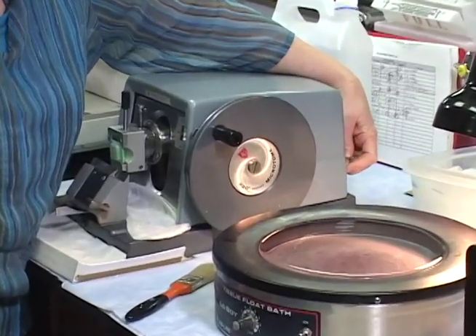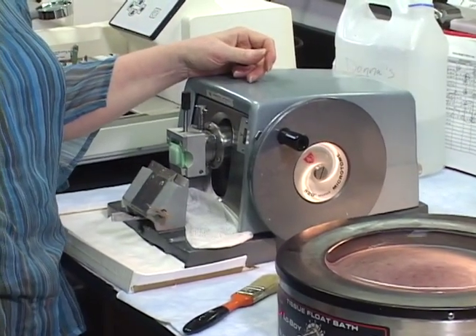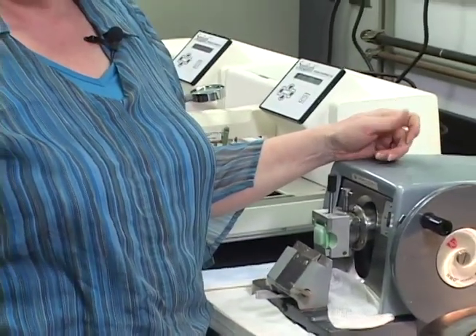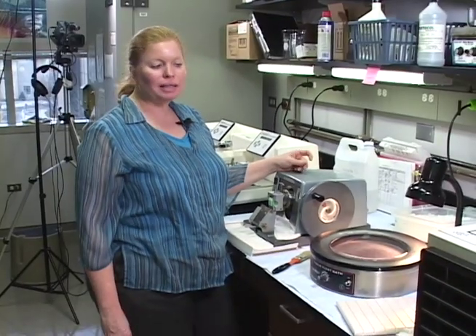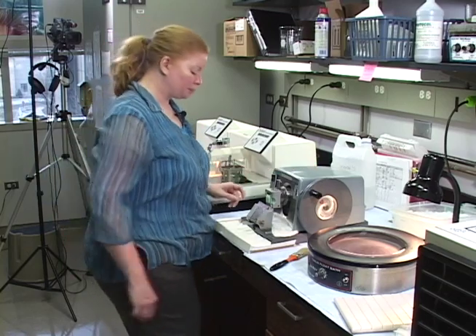Anyway, so we have ours set at 5 for those epidermal equivalents. Other tissues, you're probably going to want to have it set at 4. For kidney, renal biopsies and stuff like that, you're going to cut around the 3. For brain tissue, I recommend that you cut it at 7 or 8 microns, especially if you're looking at neurons.